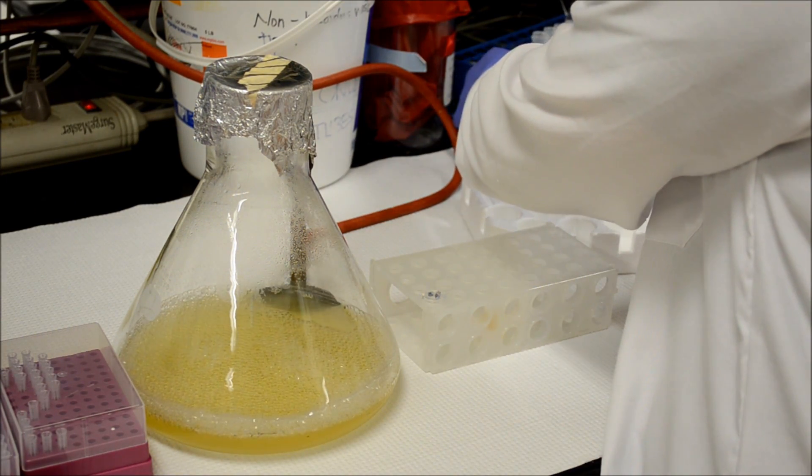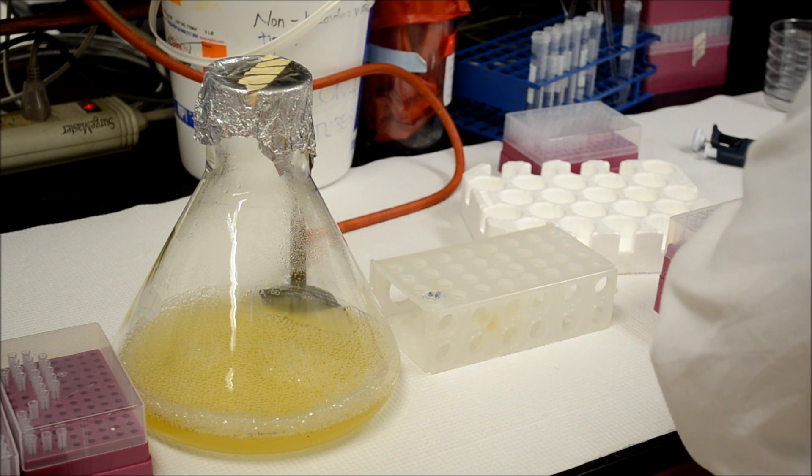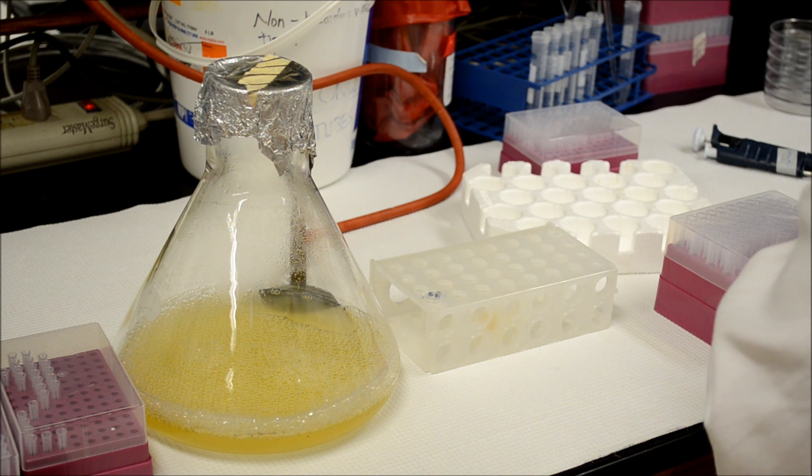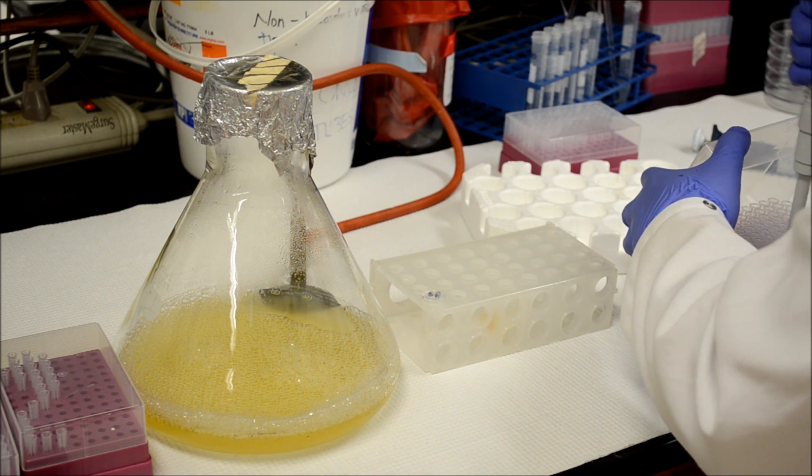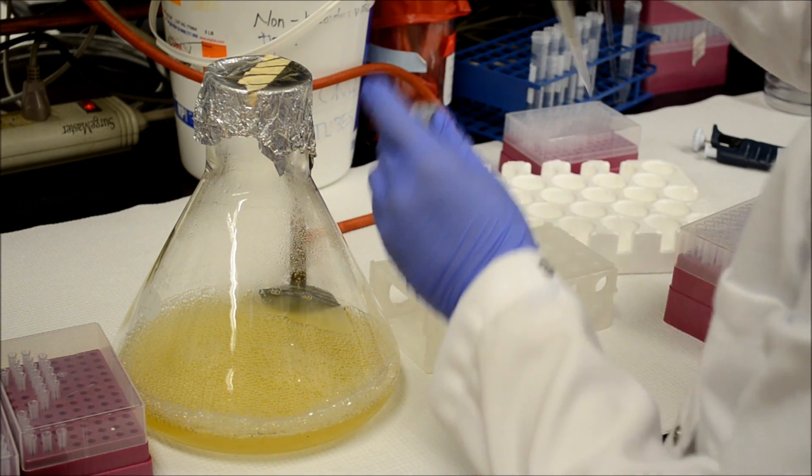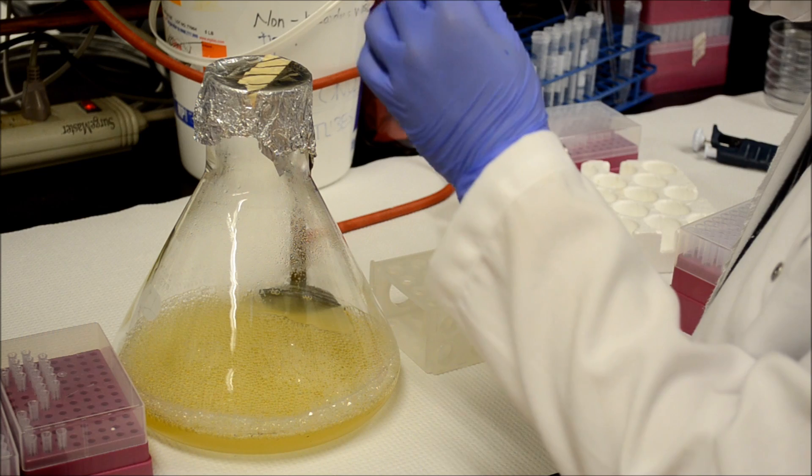For this, we need to add IPTG. What IPTG does is make the bacterial cells produce the protein that we want in large quantities. The amount of IPTG we add to the bacterial solution is similar to the amount of ampicillin that we would add. For 500 milliliters of bacterial culture, we want to add 500 microliters of IPTG.